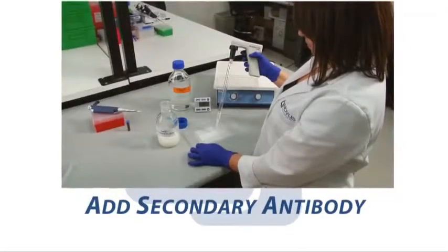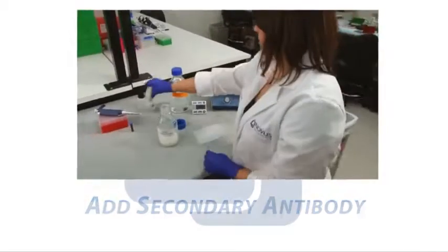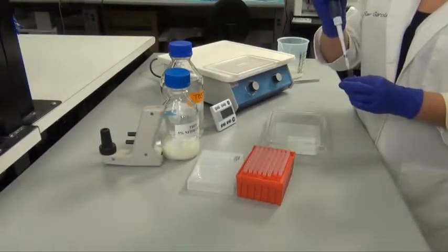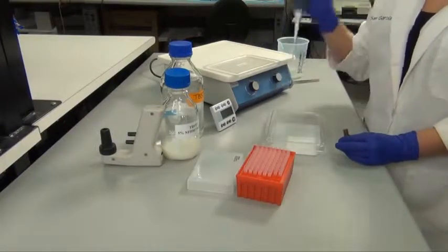After washing, dilute the secondary antibody in blocking solution and incubate the membrane for 1 hour at room temperature at the concentration recommended on the datasheet. In our example, the secondary is also conjugated to HRP for later detection.